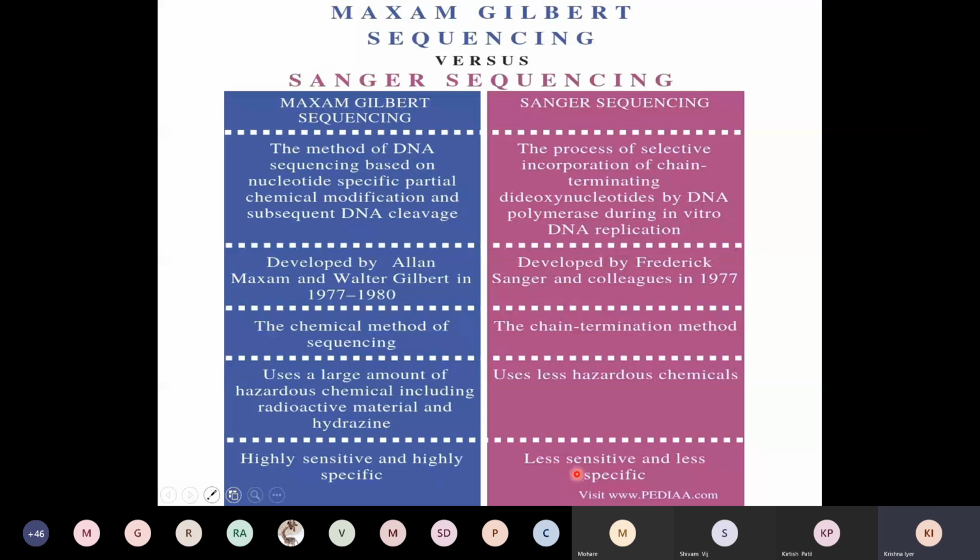This is slightly less sensitive, and sometimes it will make errors, because DNA polymerase sometimes makes mistakes. So sometimes you have to reread. So a lot of people, if they have an unknown piece of DNA, will do the sequencing experiment twice or thrice to make sure the results are consistent before they will stop.